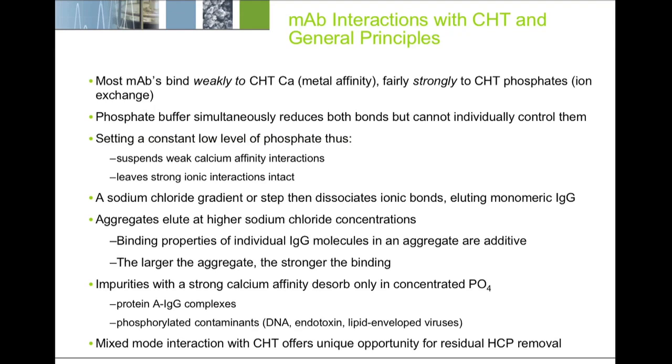Impurities, such as protein A IgG complexes, or phosphorylated compounds such as DNA, endotoxin, or lipid-enveloped viruses, interact very strongly, as I've indicated, with the calcium sites, and desorb only in concentrated phosphate solutions. Finally, the mixed-mode interactions present on CHT offer unique opportunities for residual host cell protein removal.